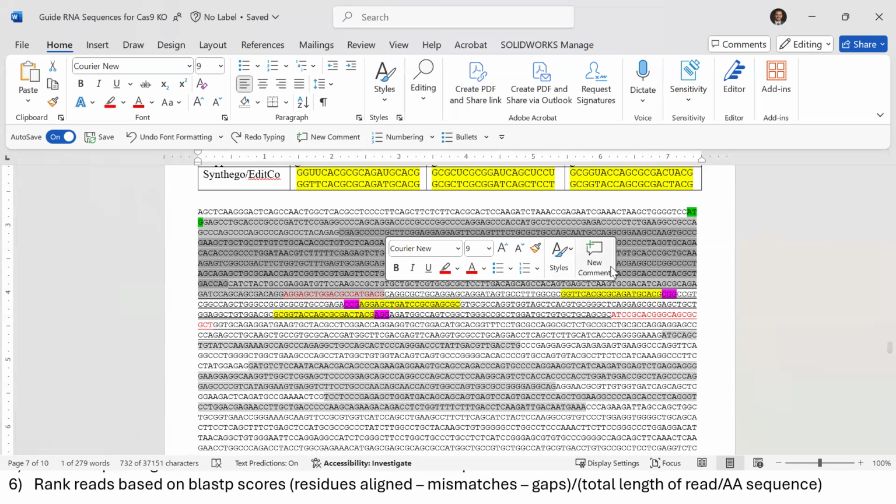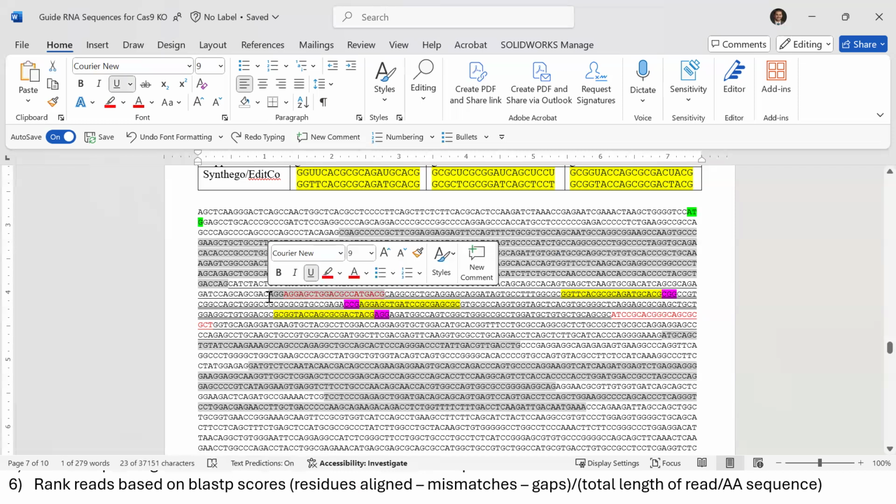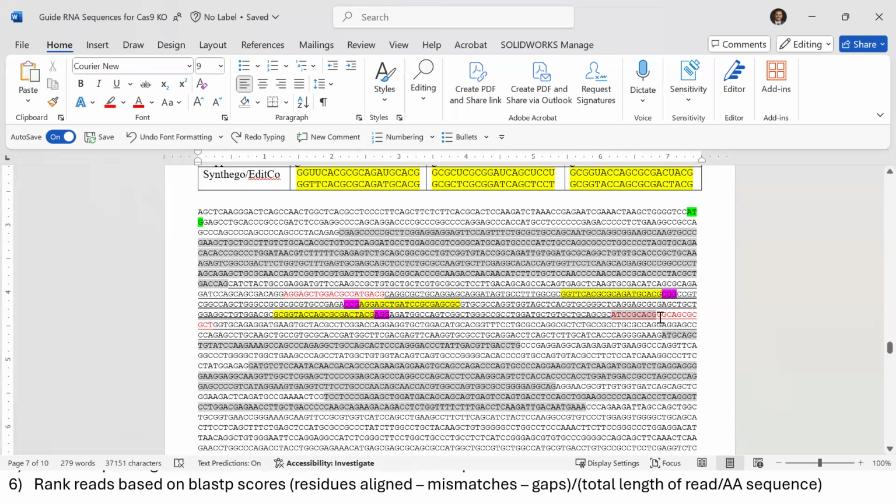And if we check the character count here, I've included the start codon and everything up to that last red character. That's 732 bases, which is divisible by 3. So we know that this CAG right here should be an actual codon in the PML gene. So we'll start translating there and then move forward. Okay. So the red and everything before it will be removed. Likewise, on the other end here, the red target here and everything after it will be removed from each read.